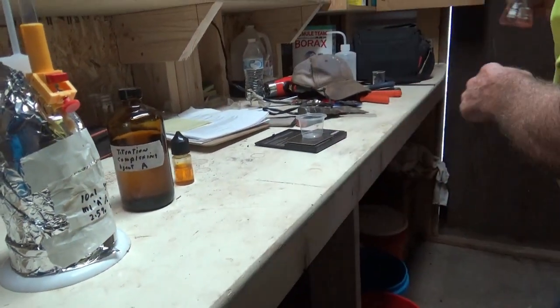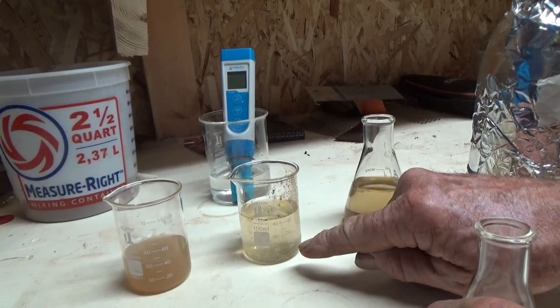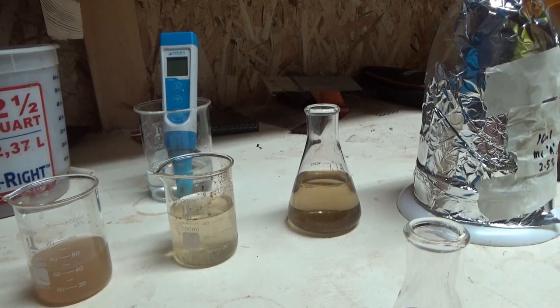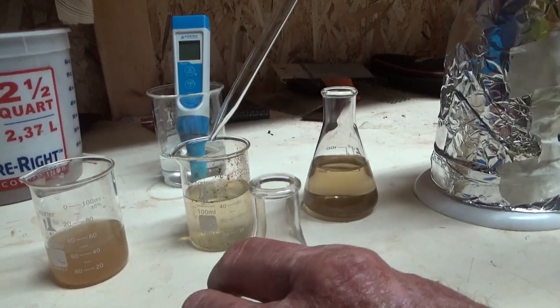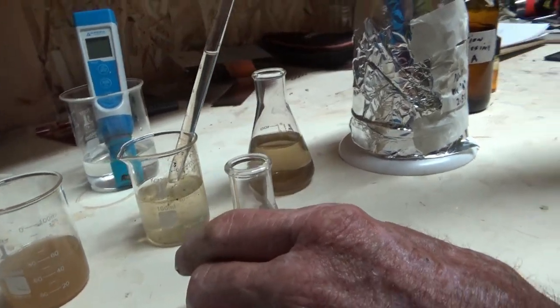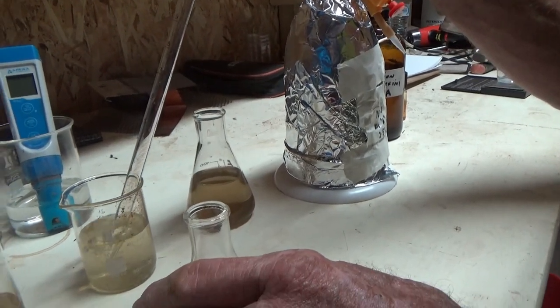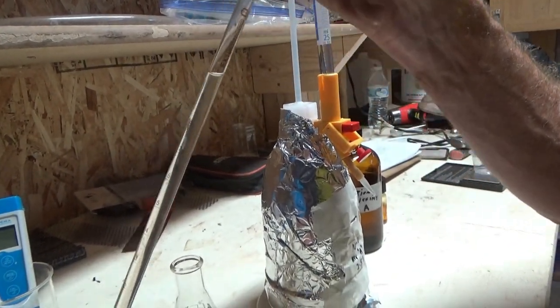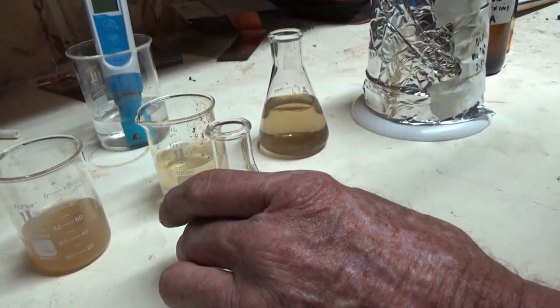Let's get another solution. Now, these are actual solutions here. This one comes from the electrolytic cell. This one comes from the pond outside, rainwater diluting all our wonderful stuff. So let's see, because we're going to be working on that tailings pad here shortly. Let's get an idea where we're at.